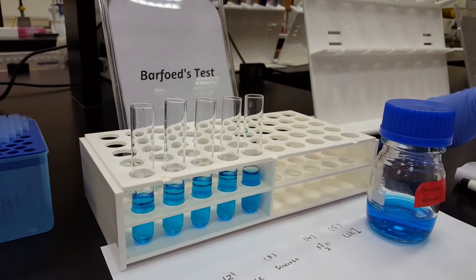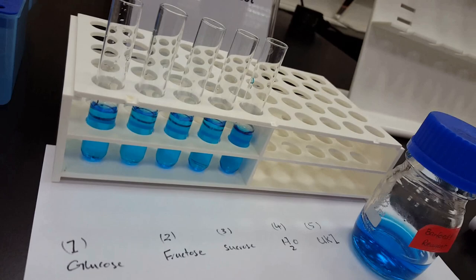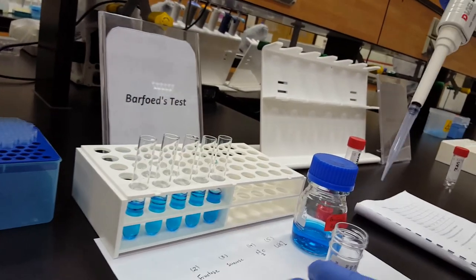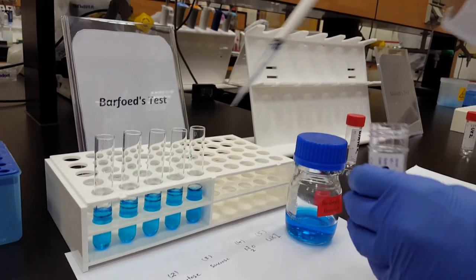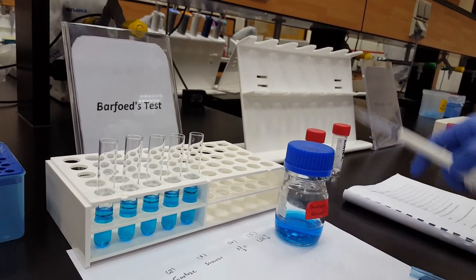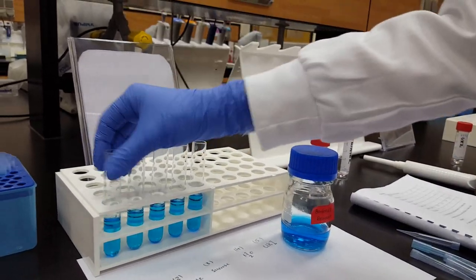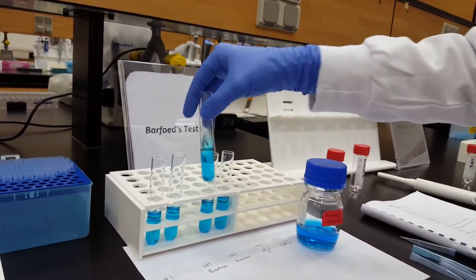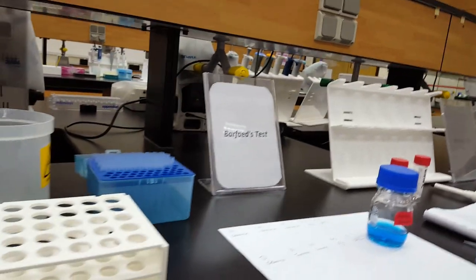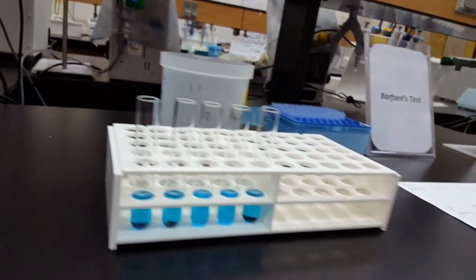And the last one is our unknown. We have just confirmed that it's not a polysaccharide, so we have unknown one. Once you are done, you mix your tubes and go to the water bath, which is boiling. Take the whole set to the water bath, and then let's assume that around 3 to 5 minutes maximum has passed.